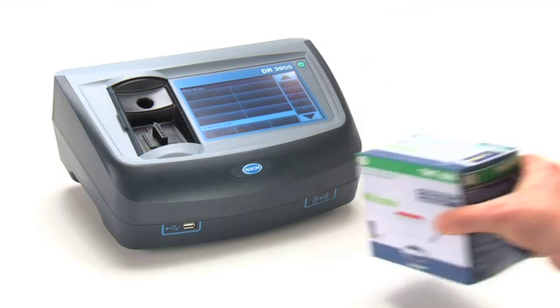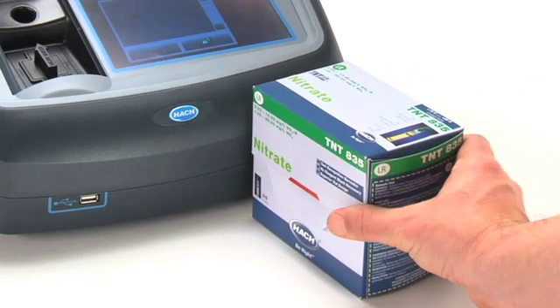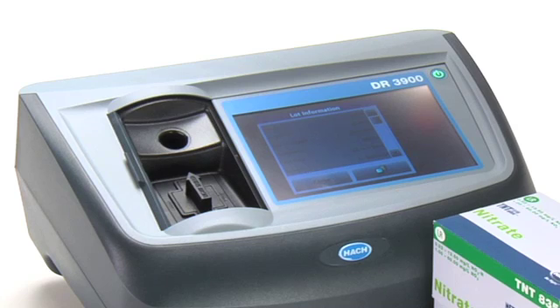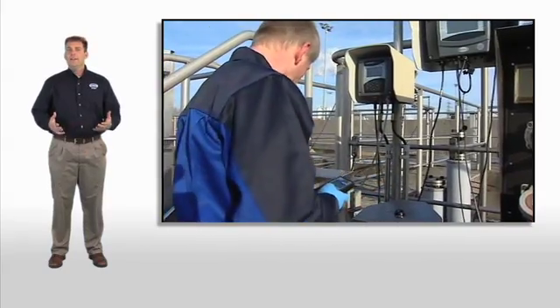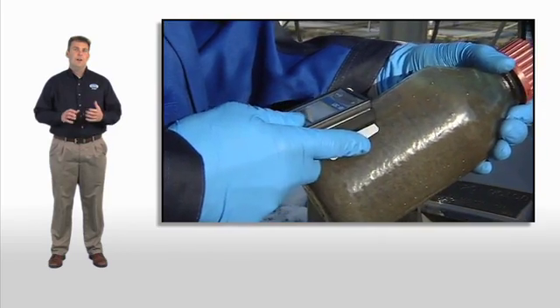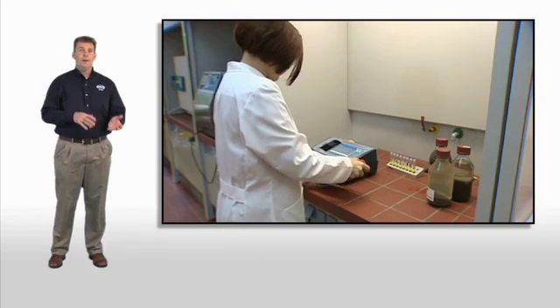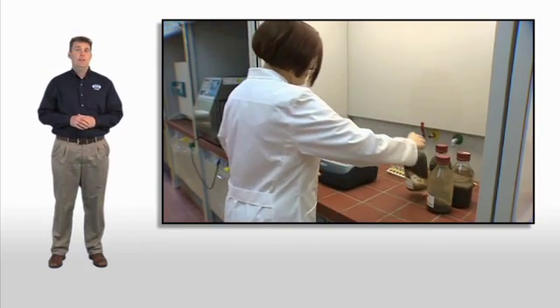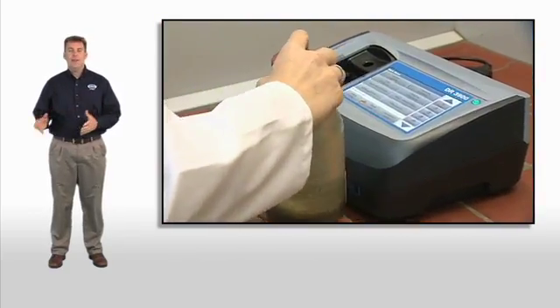The DR3900 is built with cutting-edge RFID technology. This allows the TNT Plus chemistry packaging to communicate with the spectrophotometer itself, automatically tracking your lot number, expiration dates, and general chemistry information. This RFID technology also allows for a sample tracking system, where a combination of RFID tags at your sample location, on your bottle, and with each operator allow you to track each measurement from the time you take the sample to the time you execute your reading.